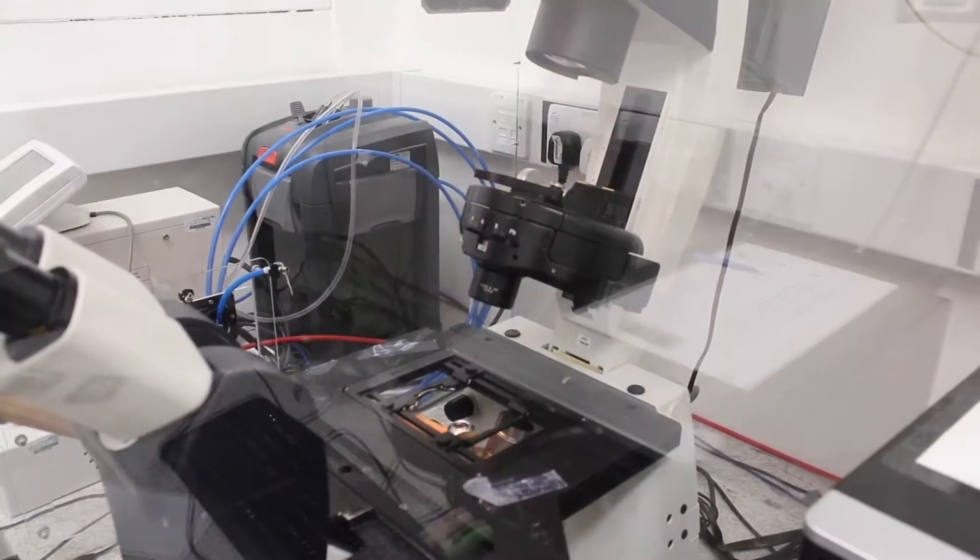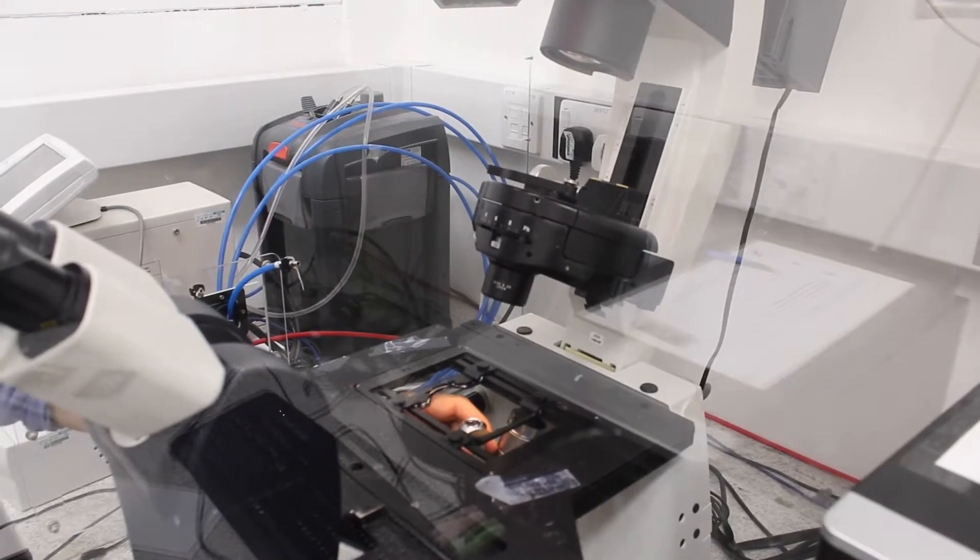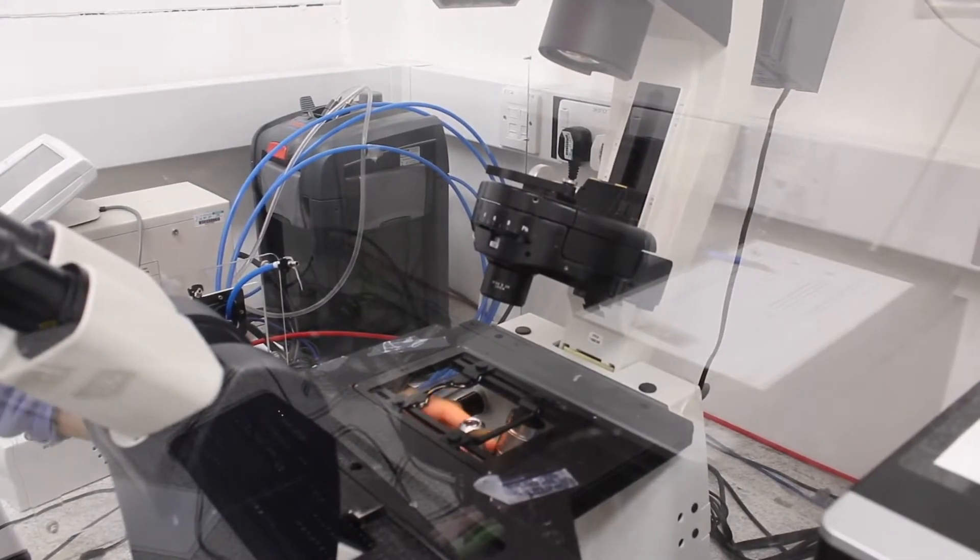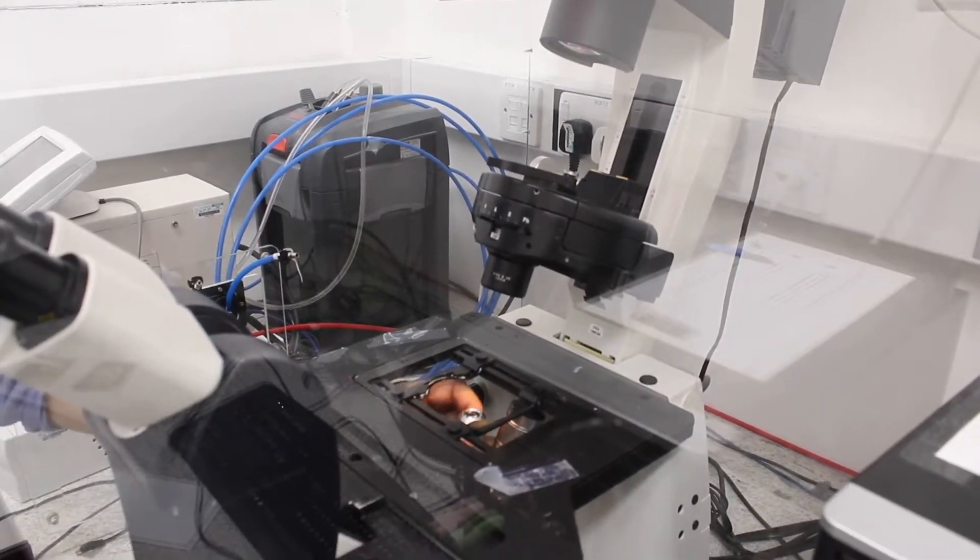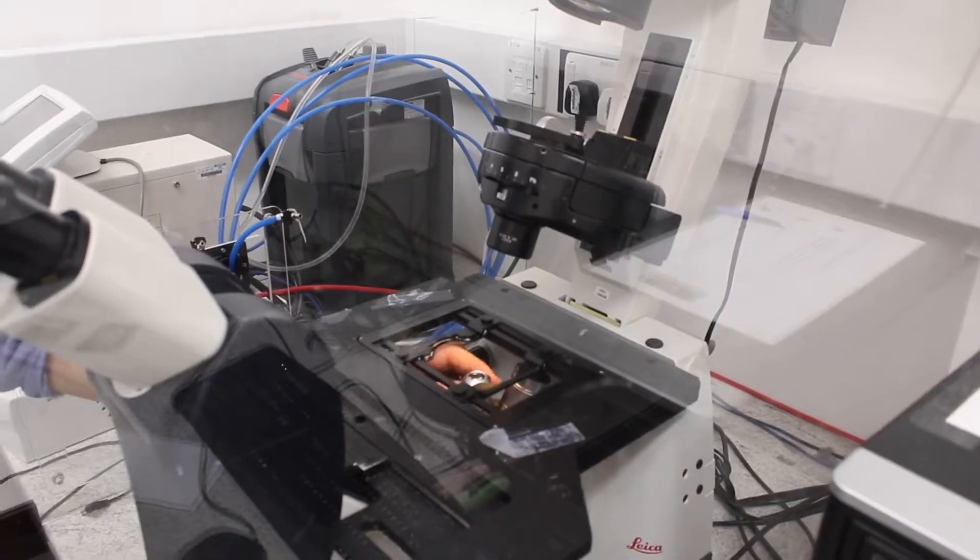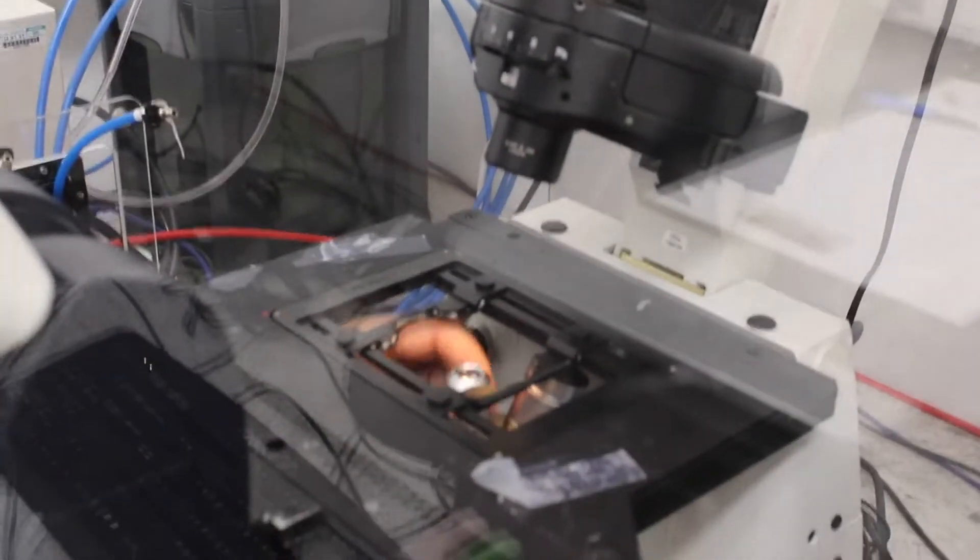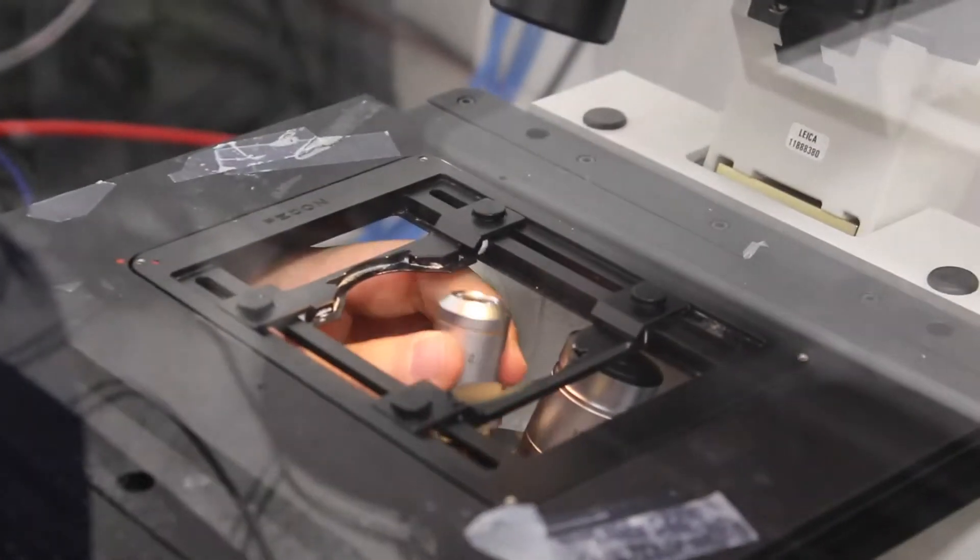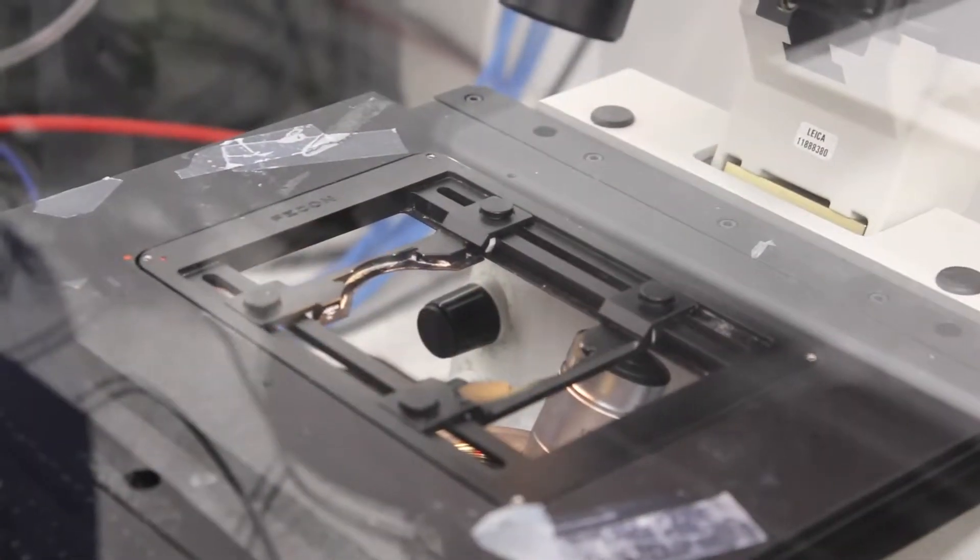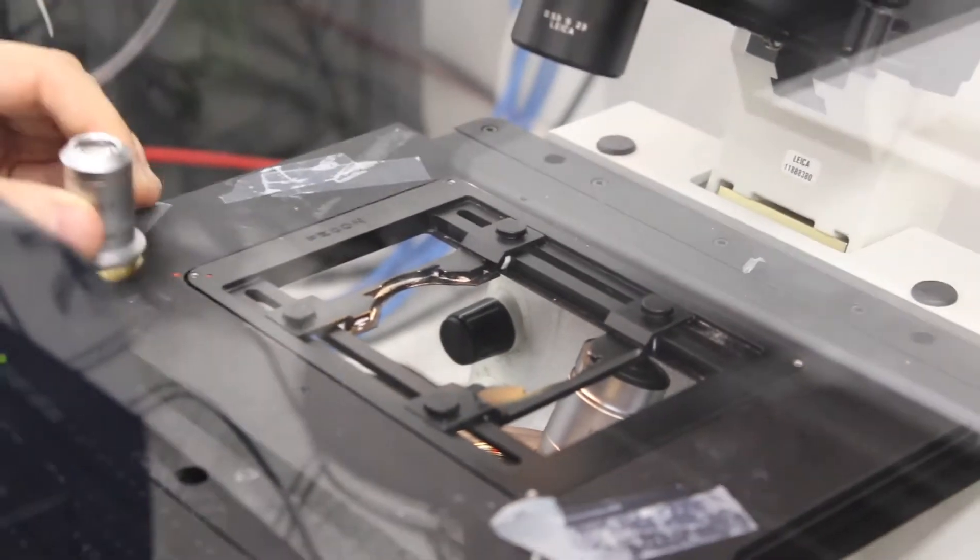So you need to unscrew one of the objectives, let's say you want to remove the 2.5, so you unscrew it until it comes out.